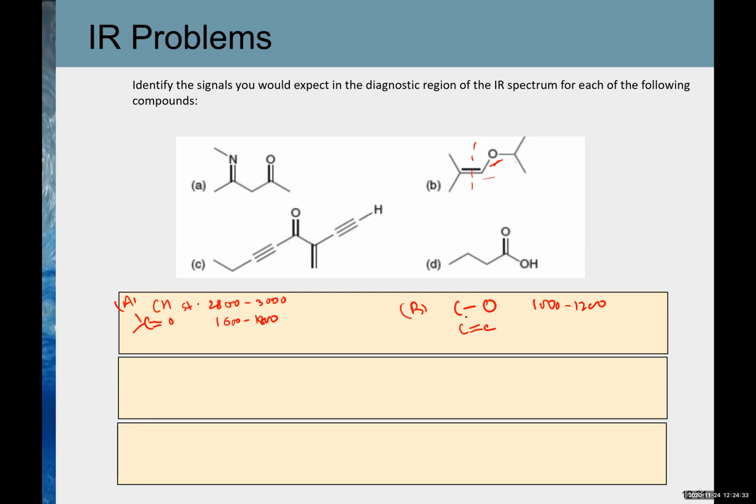So there's going to be enough polarity difference. So now I expect in molecule B, the CC double bond to show up, and it should show up nicely. And that's going to show up at around, again, 1650-ish. And of course, there will be CH stretching at 2800 and those usual ones.